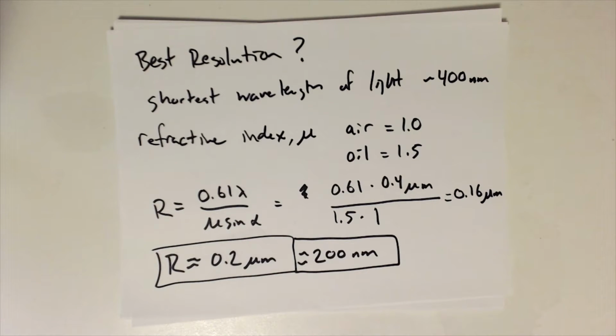So what this has done is it's given us an approximate, right? If we're using a light microscope, we can't expect to resolve features or spots that are less than 200 nanometers based on this condition. There's other limits obviously built into a light microscope system, but this is what diffraction tells us, is that we can't expect to have anything smaller than this resolved. And so we're going to need something else in that case. That's why we have limitations on the light microscope, because of this diffraction feature.